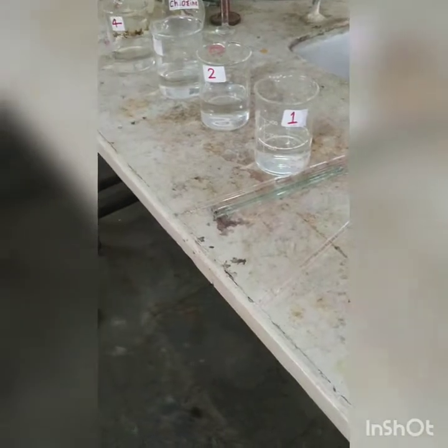Doing that calculation, we get the concentration of chlorine in the given chlorine solution as 67.36 mg per liter. As mentioned earlier, our dosages are fixed: 0.5, 1, 1.5 and 2 mg per liter.